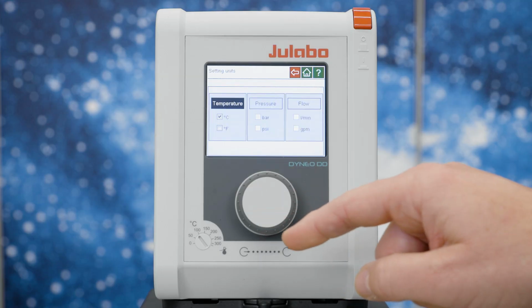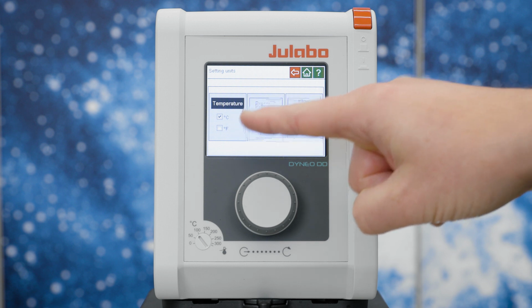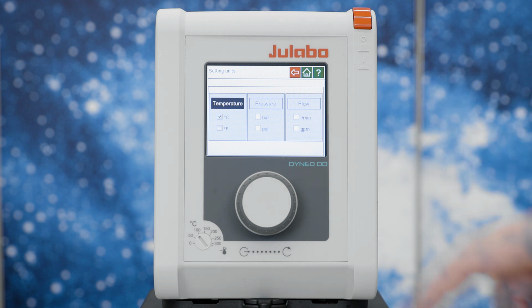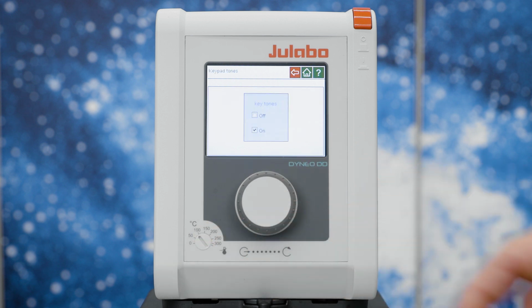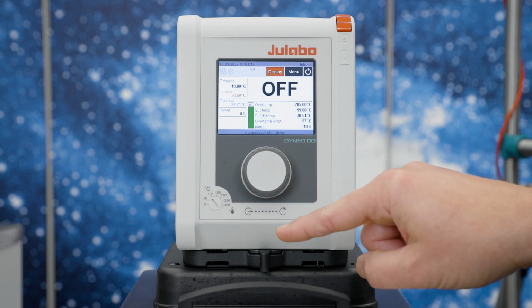Furthermore, you can change the measurement units. For example, temperature from degrees Celsius to Fahrenheit, pressure from bar to psi, or you can choose the flow rate in liters per minute or gallon per minute. To get acoustic feedback, you can set keytones. Back on the home screen, you can switch between 3 different views.